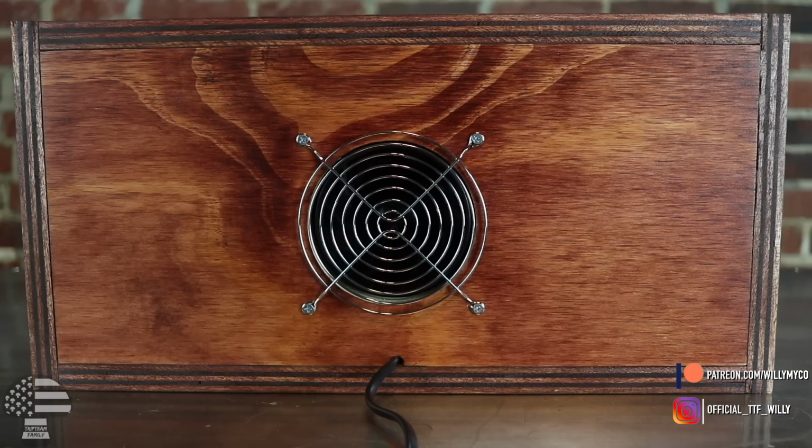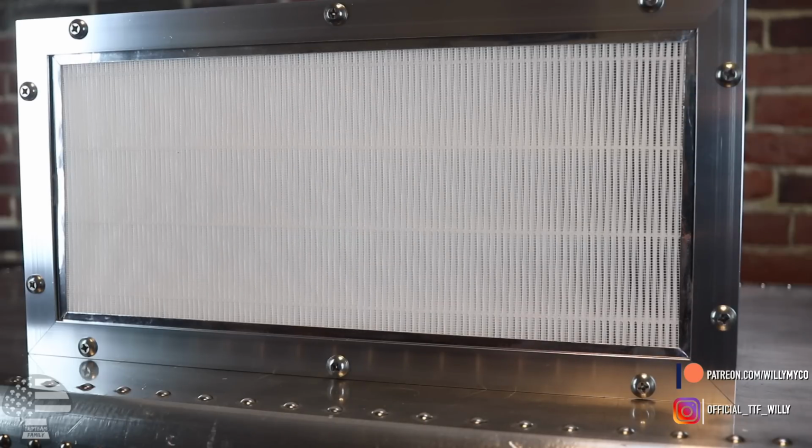Now, this is considered an FFU, so a fan filter unit. So the fan is actually built into the flow hood. Now, if you go back to the video where I showed you how to make your own flow hood, you'll see that we have a big squirrel cage fan or a blower motor on top of the unit. This one, it's actually built into the flow hood itself, so it's a lot more compact. It also uses a different style HEPA filter, but it's just as efficient, does the same exact thing.